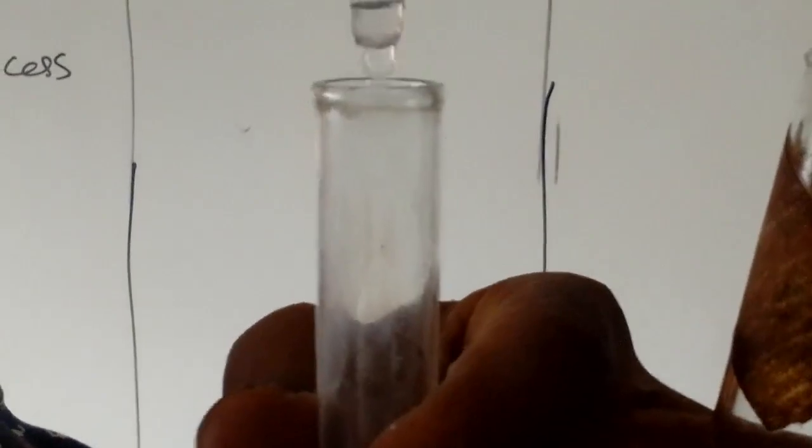Then, using aqueous ammonia, we're going to add a few drops of ammonia into this solution. This is ammonia. Using the dropping pipette, I'll collect some ammonia and then add a few drops inside it. You see, this is white.